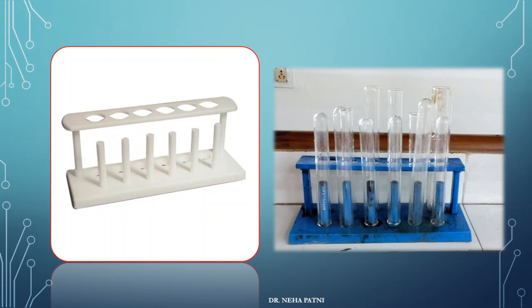This one is very easy to identify — this is a test tube. This is a test tube holder or stand. Now this one is a boiling tube — if you can make out the difference, the test tube has a narrower diameter while the boiling tube has a wider mouth and is broader. Sometimes when you want to keep a substance and heat it on the burner, we normally use a boiling tube so that the volume is increased, since the volume in a test tube is very less.